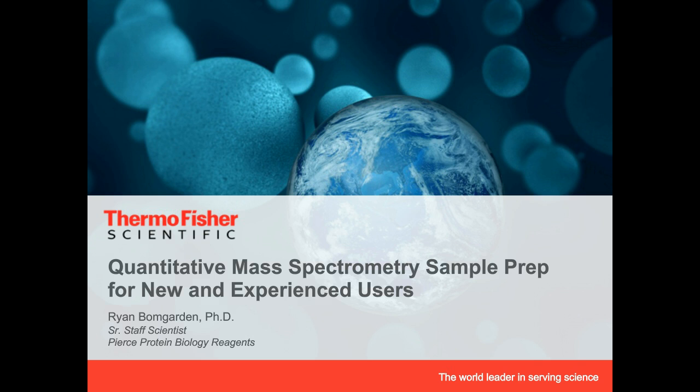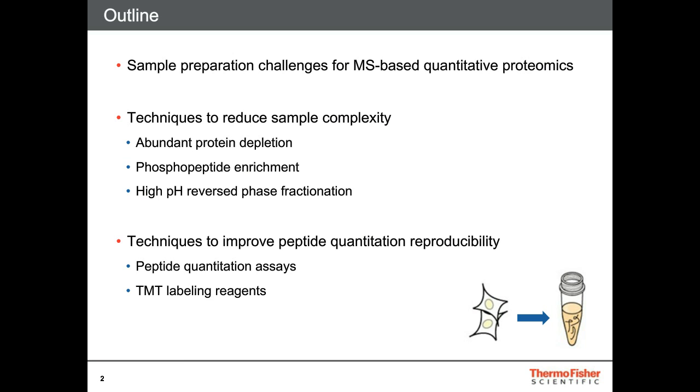Thank you for that introduction, and welcome to the first part of a two-part webinar on mass spectrometry sample prep for quantitative proteomic workflows. Mass spectrometry has become a predominant technique in biological research by enabling the identification, characterization, and quantification of proteins on a global scale with high accuracy and precision.